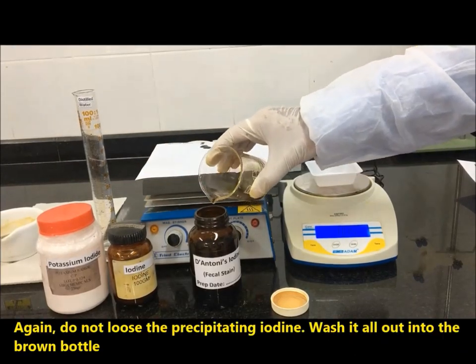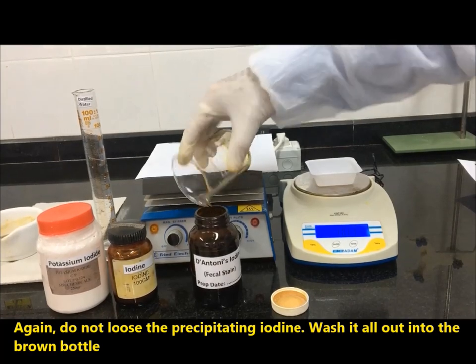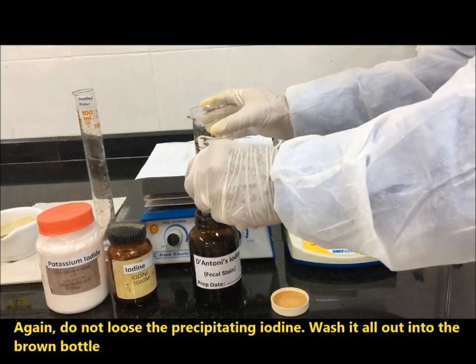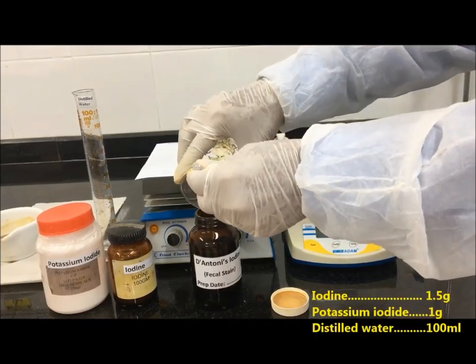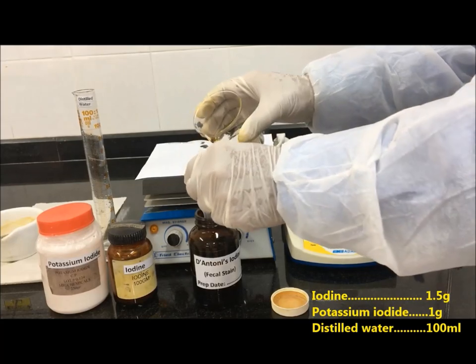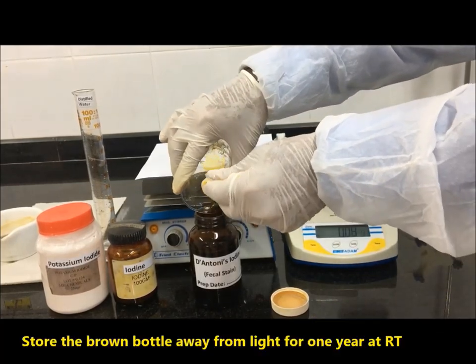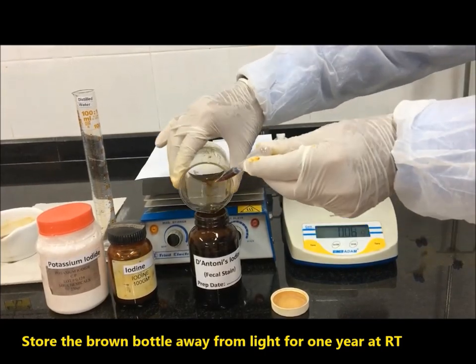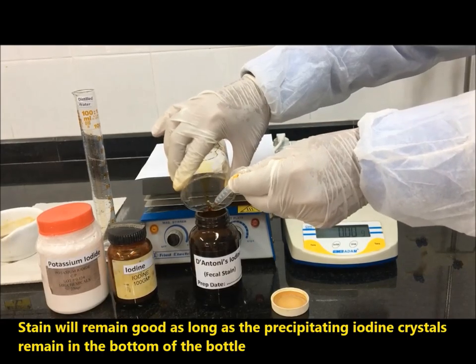Again, do not lose the precipitating iodine — wash it all out into the brown bottle. Store the brown bottle away from light for up to one year at room temperature. The stain will remain good as long as the precipitating iodine crystals remain in the bottom of the bottle.